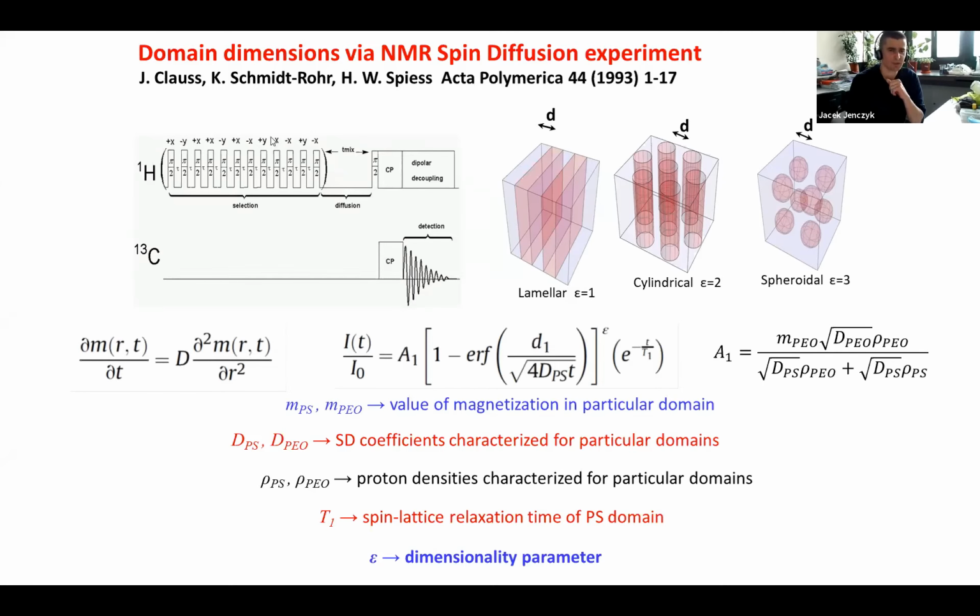And this process might be described using ordinary diffusion equation, and therefore Bloembergen called that process spin diffusion. Tracing what is really going on with our NMR signal with time, with the so-called mixing time here, we can sample this mixing time and observe how our signal behaves as a function of mixing time.